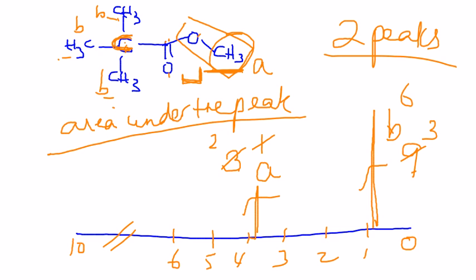So it's a relative ratio that it looks for, not an absolute ratio. And since it's a fraction, it doesn't have to be exactly 3.00. You could see a 3.1 or 9.2, and so you just go for the nearest whole number for that particular proton. Okay?